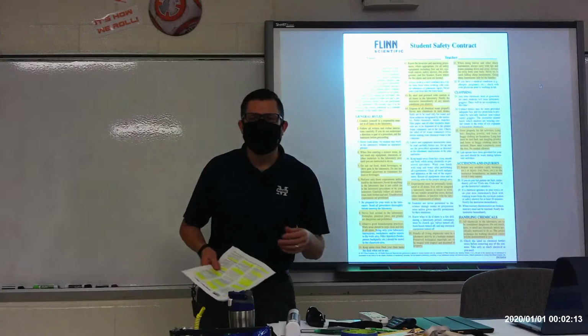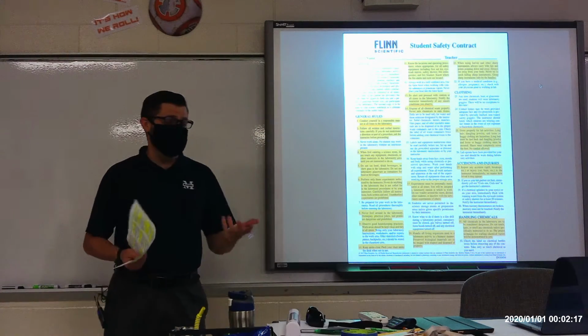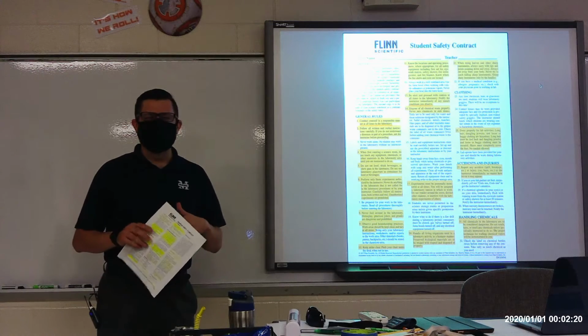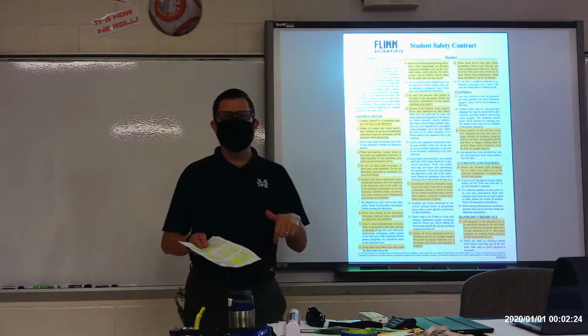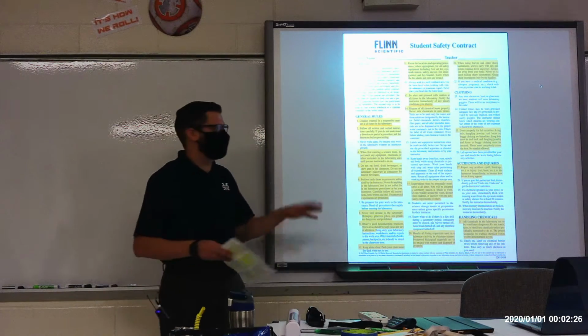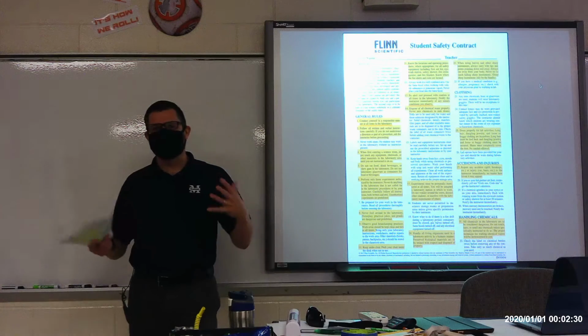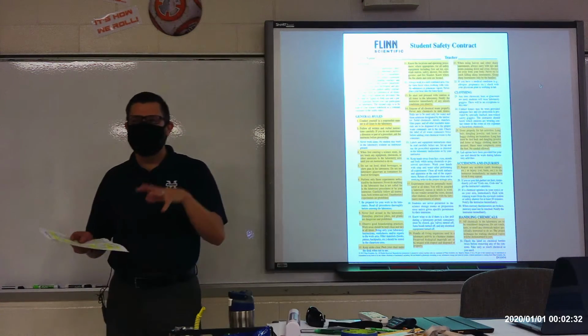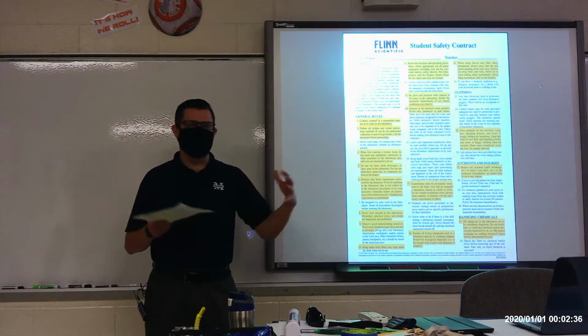This safety contract is a very generic contract for any science lab, so not all of the rules that are found here are applicable to this class in particular. And this is also set up for college level science labs as well as high school level. So some of these won't necessarily apply to us either because of just the way that college labs are set up.